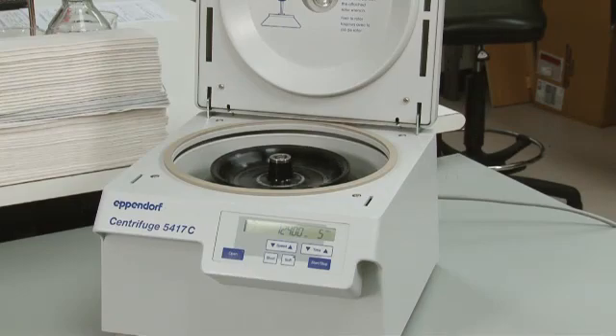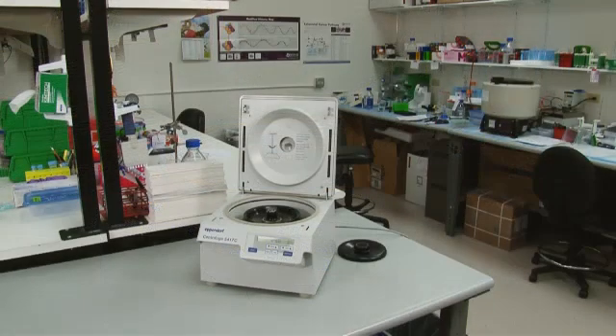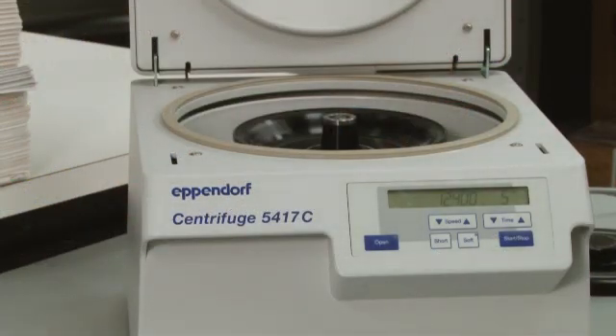After the samples have been successfully sheared, centrifuge at 4 degrees Celsius for 5 minutes at 12,500 G. Remove the supernatant and transfer to a new tube or aliquot into 10 40-microliter samples. These samples can be safely stored at negative 80 degrees Celsius for up to one month.